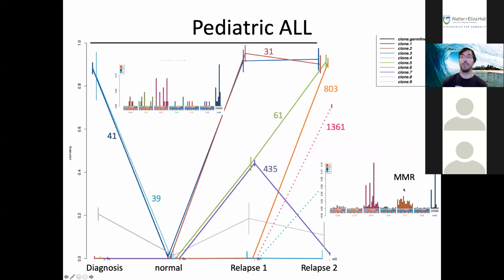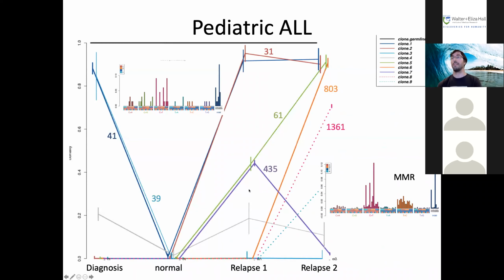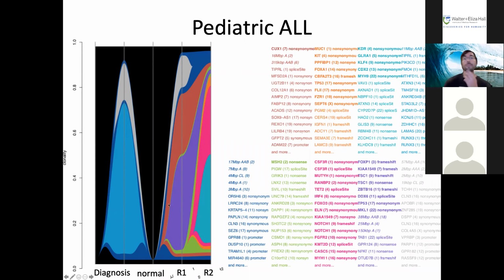So we then go and look at the river plot. So this is showing essentially the same thing. You see the blue early cancer clone here, see the light blue diagnosis specific, and the red clone is the relapse specific one, and then the green clone is the last low mutation rate one here. This is essentially the same as this plot here, it's only shown in a different way. And color matched to this are also the mutations assigned to each clone.